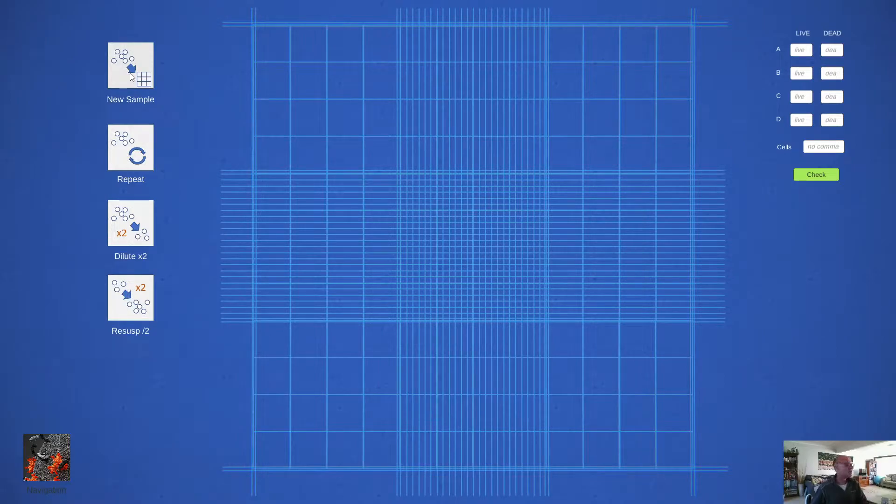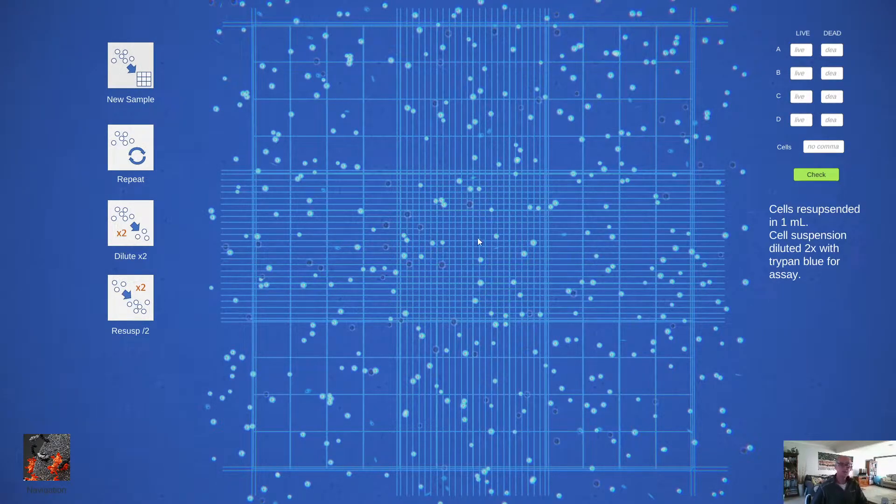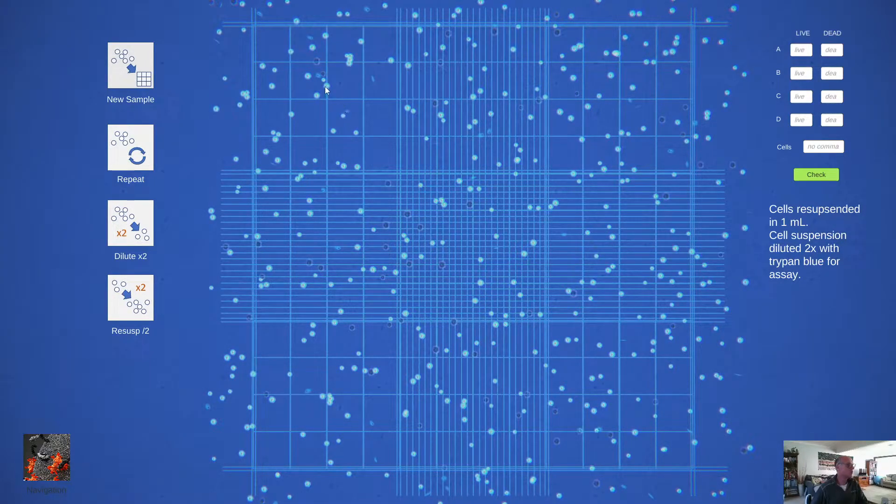Basically, the operation is very simple. You generate a new sample and you can see that the detail is quite nice. We've got the cells, but we've also got some debris and some dead cells.